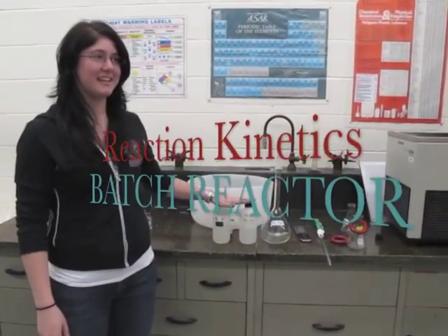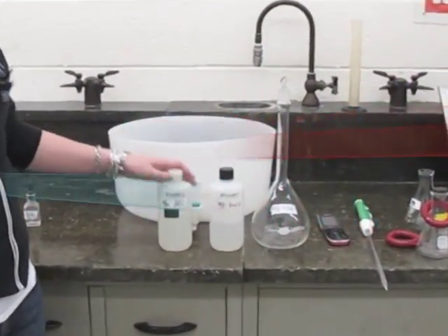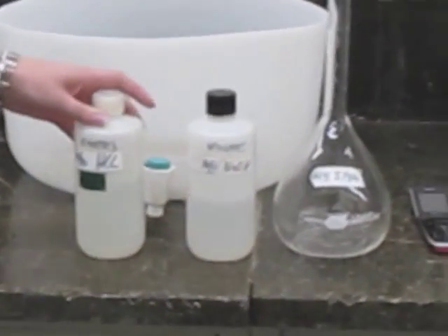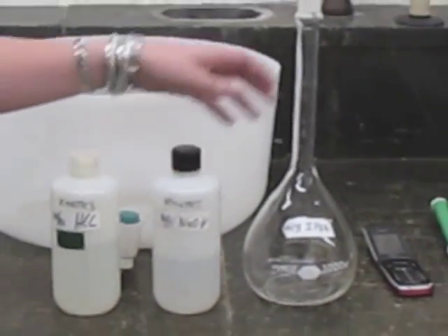The first reactor we use in the kinetics experiment is the batch reactor. The reagents we use are hydrochloric acid, sodium hydroxide, and isopropyl acetate.